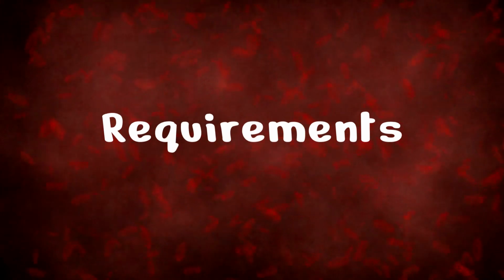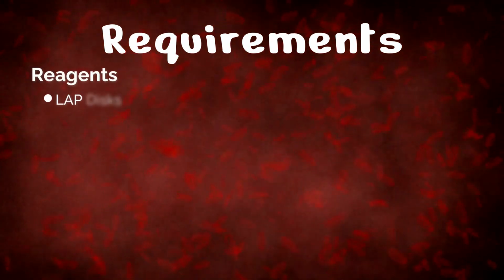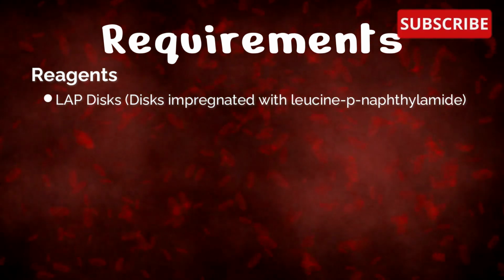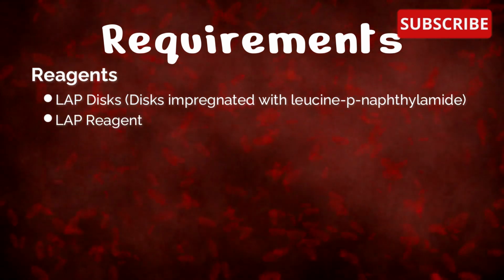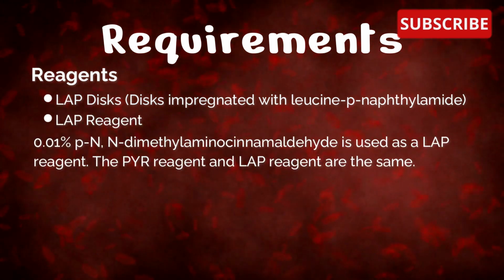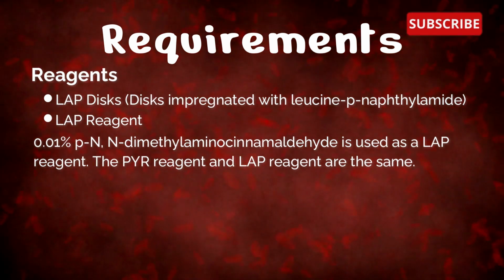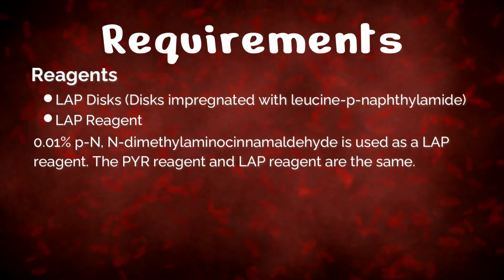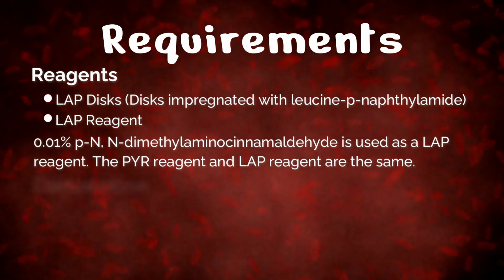Let's see the requirements for the lab test. The reagents are a disk impregnated with leucine beta-naphthylamide, and next, 0.01% p-N,N-dimethylaminocinnamaldehyde is used as the reagent. The PYR reagent and this reagent are the same.